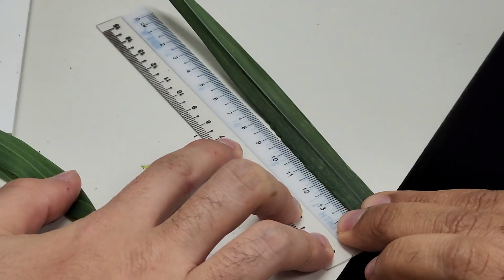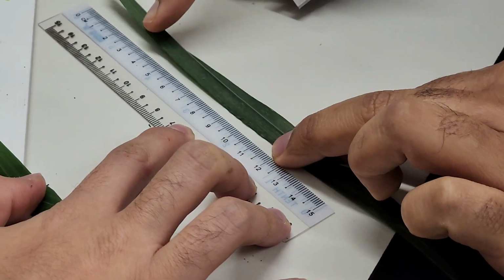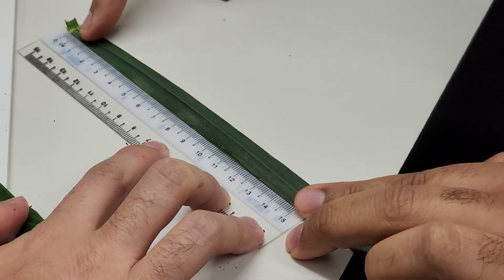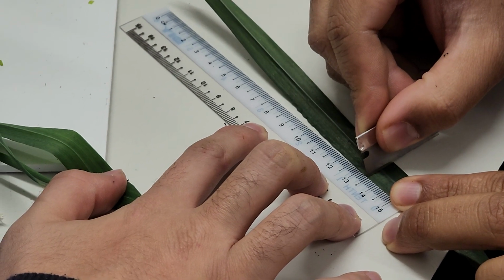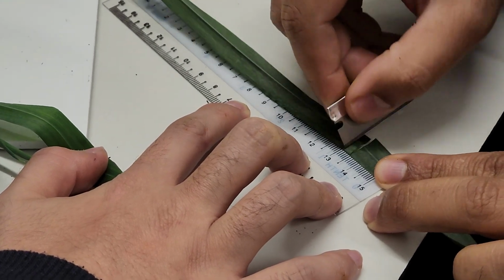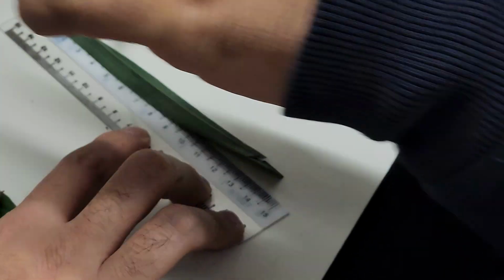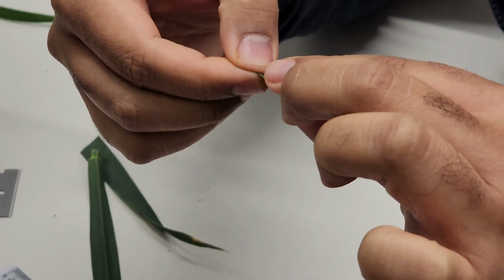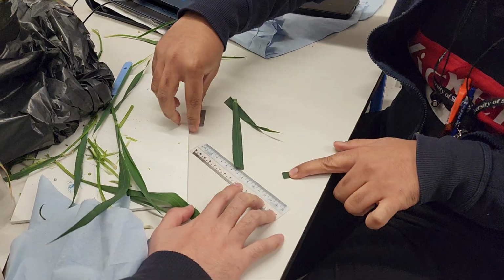We take 0.5 centimeter before 14, which is 13.5, and another at 14.5. That's it. And do the slanting cut, because we need to know which is the top.